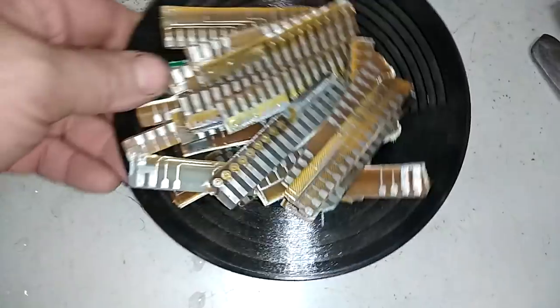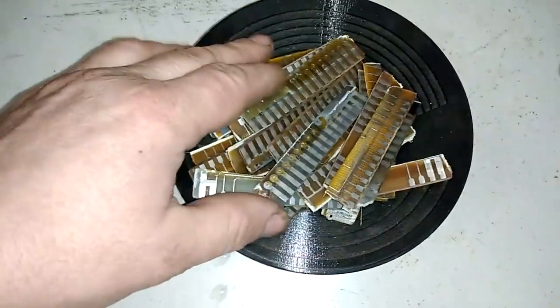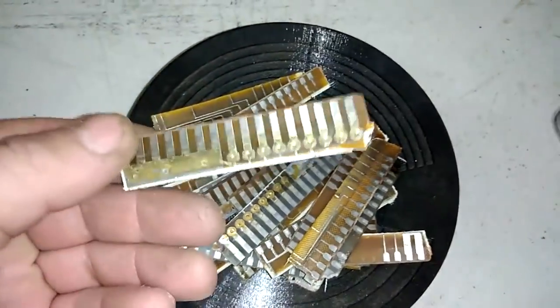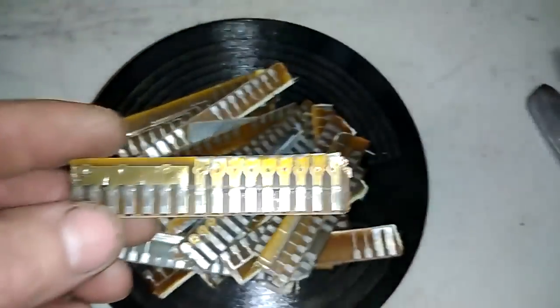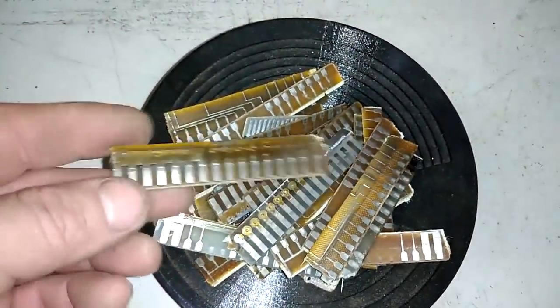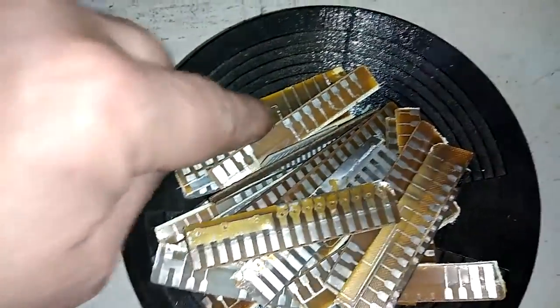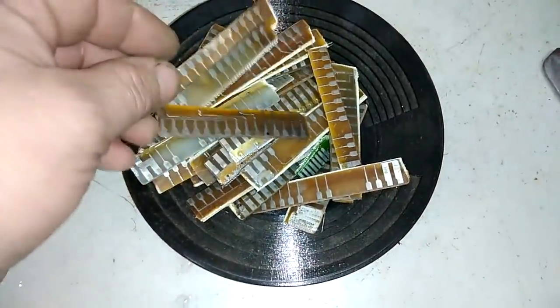Hey guys, welcome to a new video of Rina and Dushin. In today's video I got some small palladium recovery from palladium fingers. You remember that board stocked with the palladium which I showed you? So here I removed that finger from that board and I saved the board because I noticed some palladium presence on the traces on the board. So I cut only the fingers for this time and let's recover some palladium.